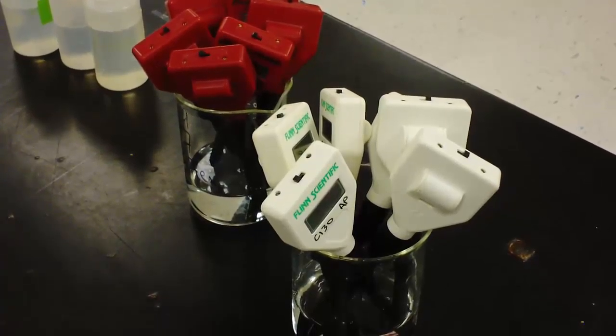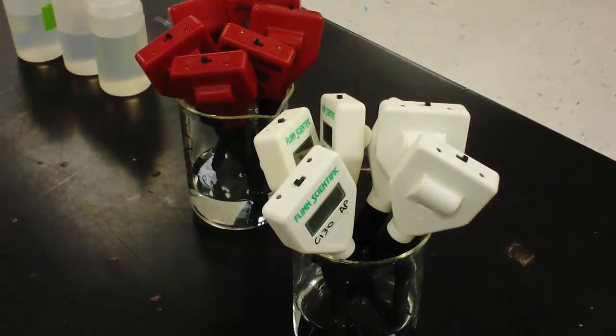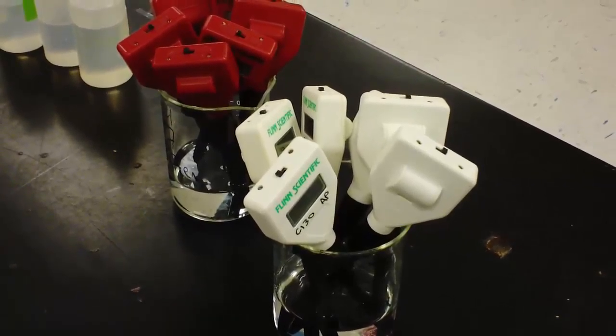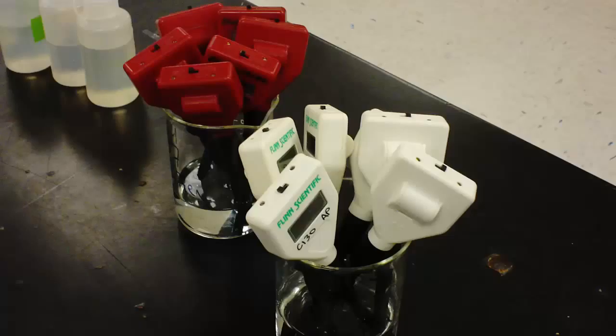When you're done, take it out, rinse it with distilled water, turn it off, and put it back in the beaker so it's ready either to be put away at the end of the day if you're fourth period.